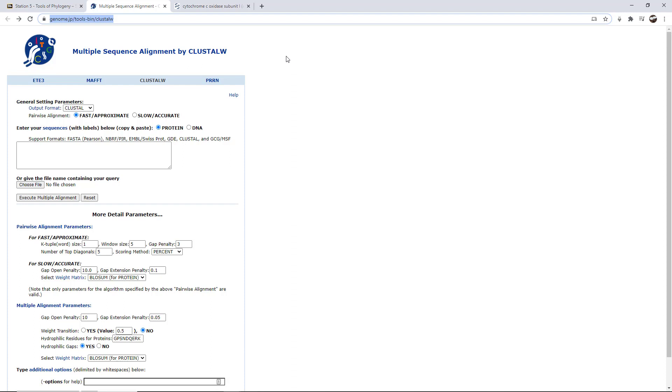There are a number of tools that you can download, including ClustalX, which I believe is a downloadable version to work on your desktop. But there are a number of programs out there like Mega and ClustalX and so forth, but we're going to use this one this way. We don't have to download anything to our computers and can be sure that we're getting all the same experience online.